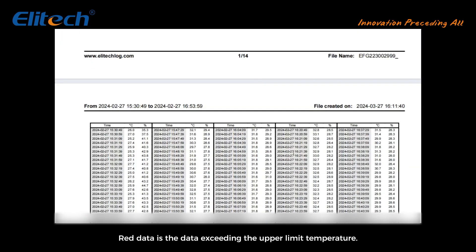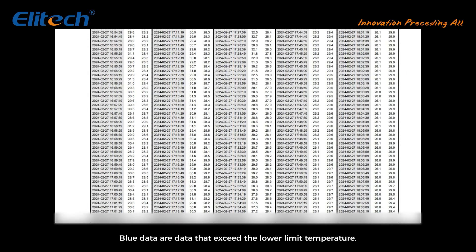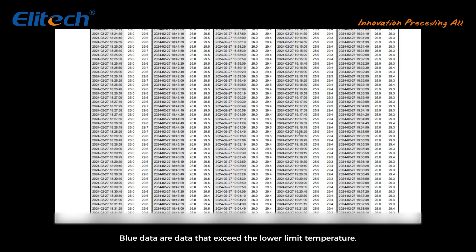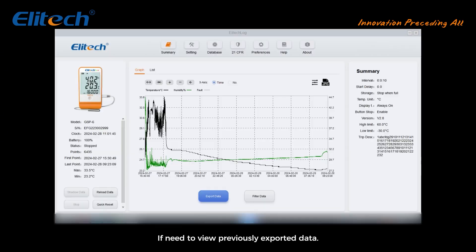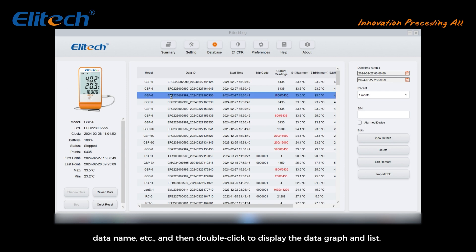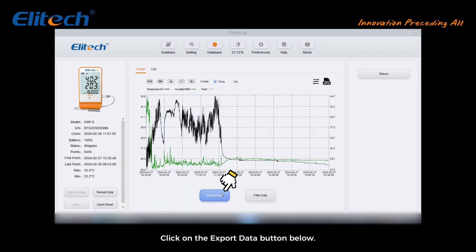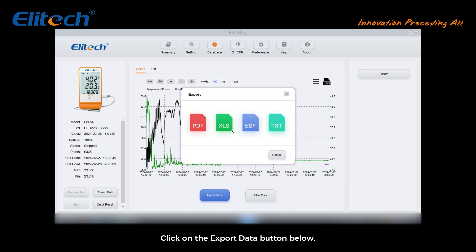Red data indicates data exceeding the upper temperature limit. Blue data indicates data that exceed the lower temperature limit. To view previously exported data, click the Database button above. Find the corresponding data according to the model, data name, etc., then double-click to display the data graph and list. Click the Export Data button below to export.